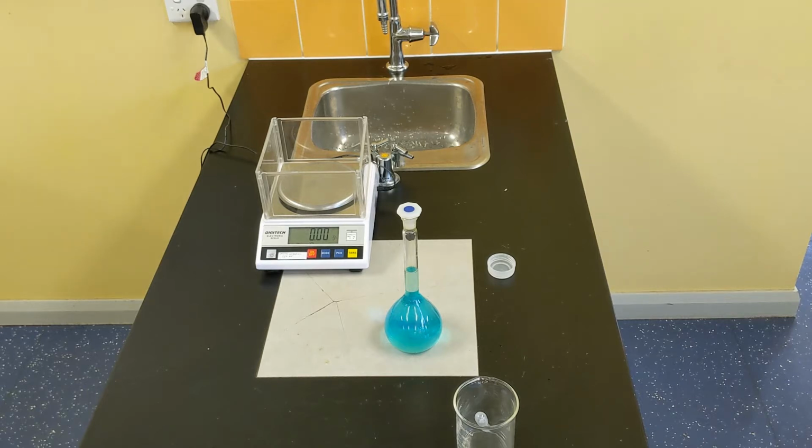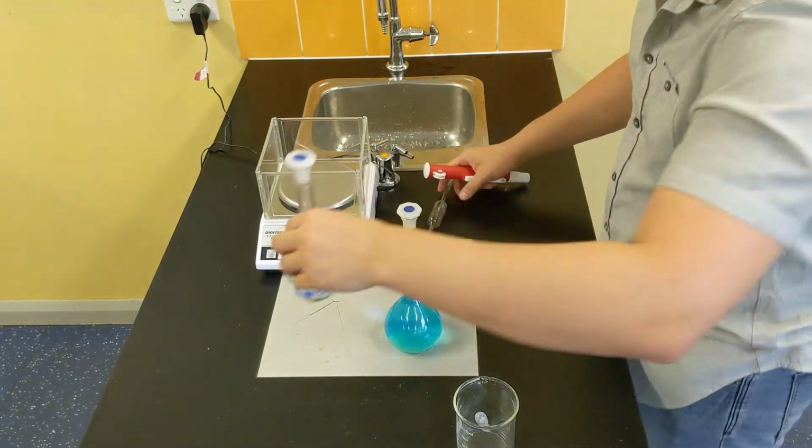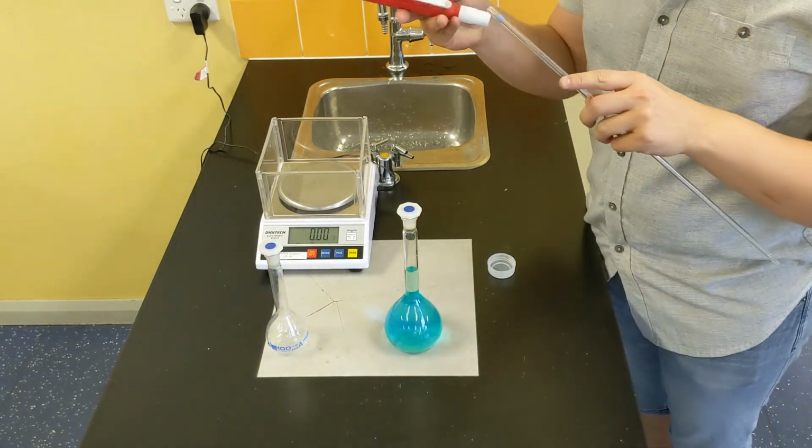Now to do that, I'm going to be bringing in a volumetric pipette. Now, a volumetric pipette is made of glass as well. It has a single mark, usually, to mark out one particular volume exactly. It's really high precision. So this one is a 25 mil volumetric pipette.